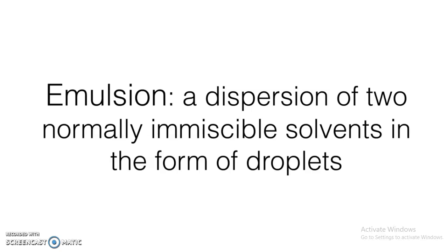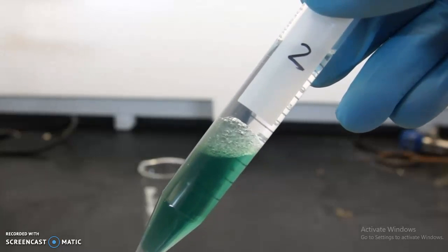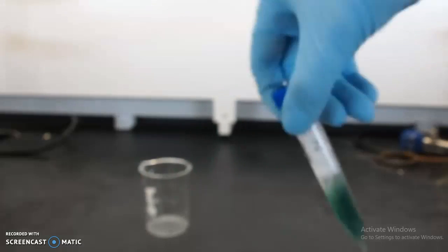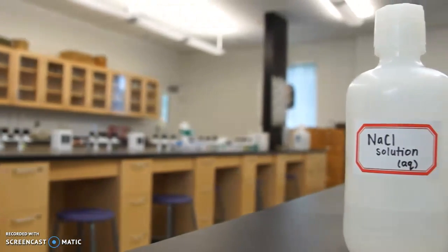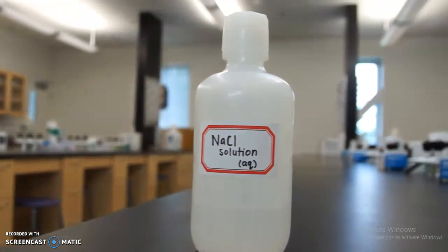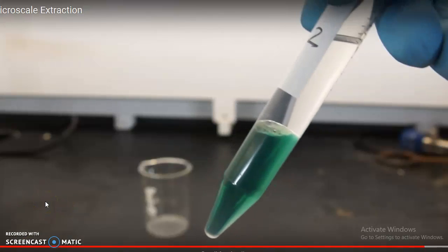Sometimes during extraction, you might get what's called an emulsion, a dispersion of two normally immiscible solvents in the form of droplets. If you have an emulsion like we have here, you want to try and clear it up. Make quick, fast swirls of the tube. You could also try adding some sodium chloride solution. You want to make sure your emulsion is cleared up before you try separating the layers.